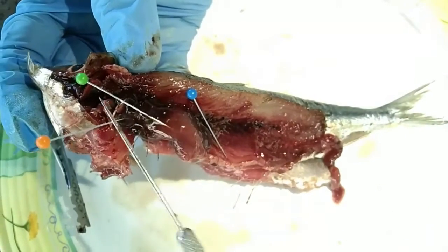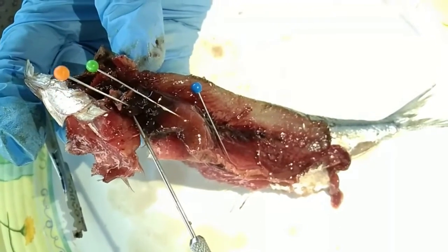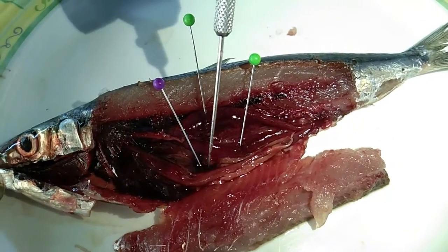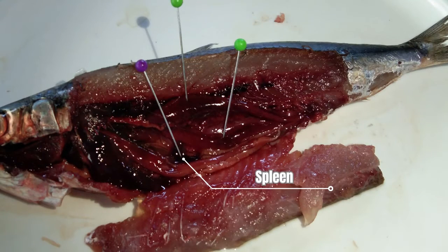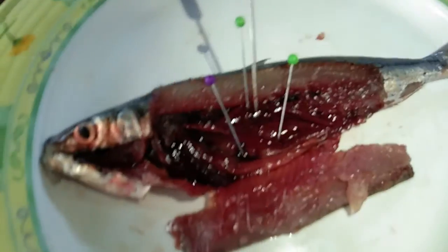For the circulatory system, the organs identified are the heart and the spleen. The heart of a fish is a two-chambered heart — it has one auricle and one ventricle. Blood from all parts of the body is sent to the auricle; the auricle pumps blood to the ventricle, and the ventricle pumps blood to the gills for oxygenation. The spleen can function as an important reservoir for red blood cells, which may be released into the circulation to increase hematocrit during energy-demanding activities.